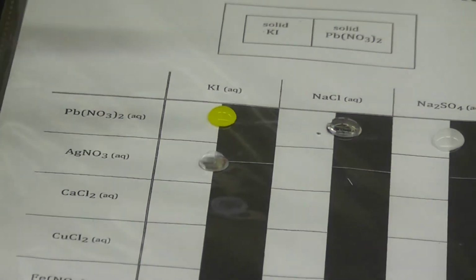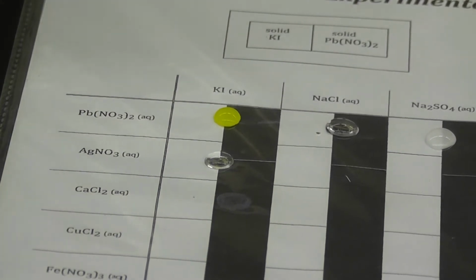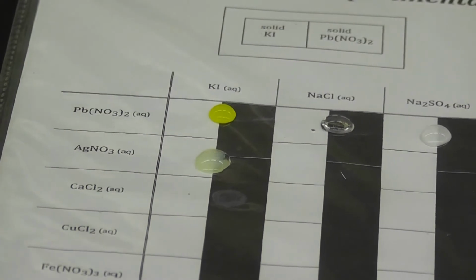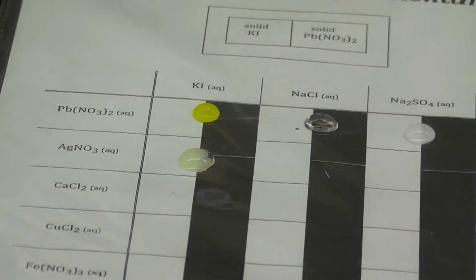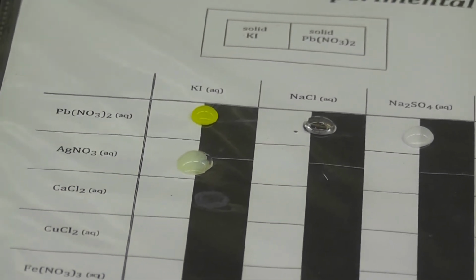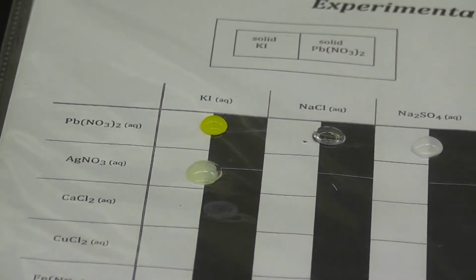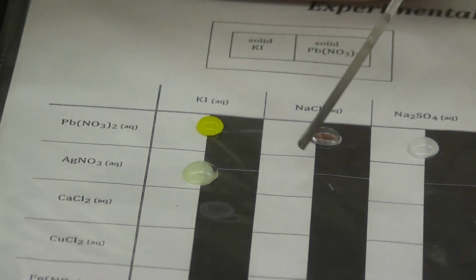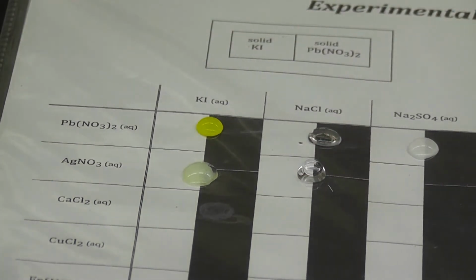So first we're going to match it with the potassium iodide. I'm going to add 1 drop and see what happens. All right. So that's the silver nitrate with the potassium iodide. So record your observations for that reaction. Now we're going to match it up with the sodium chloride. So 1 drop. Between, oh, that one. There we go. So air bubble in that one.